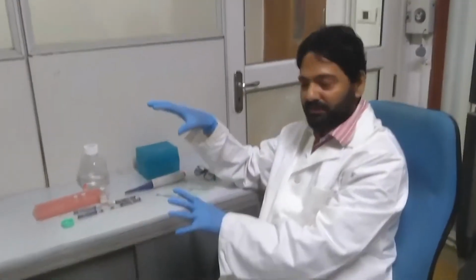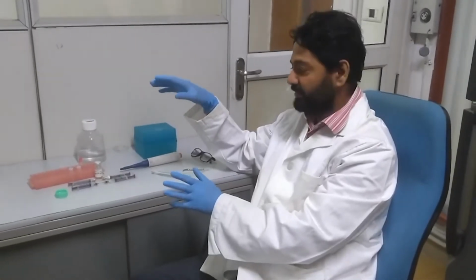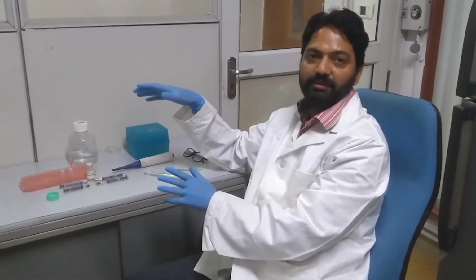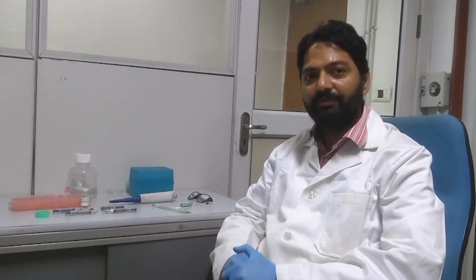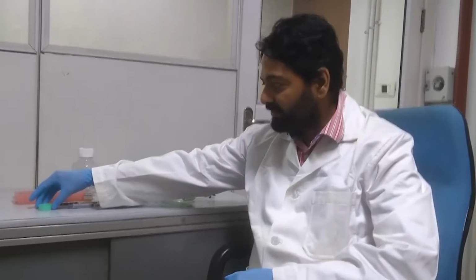So this was the process by which we prepare the emulsion for injection. This is the first step of preparing the emulsion. Now let us understand why we prepare the emulsion. We have checked that the emulsion is formed.